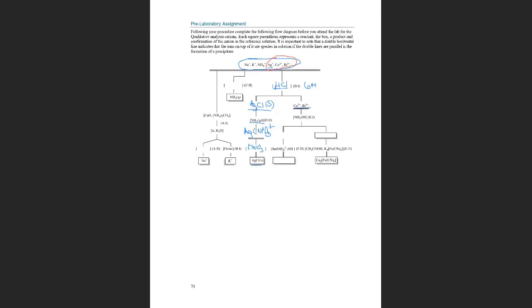What happened with these 2? We just saw some of the reactions. The first thing you do, you add ammonia. It's the same thing as ammonium hydroxide. You can write it like NH3 or NH4OH, which is basically with 1 water. So what happens?